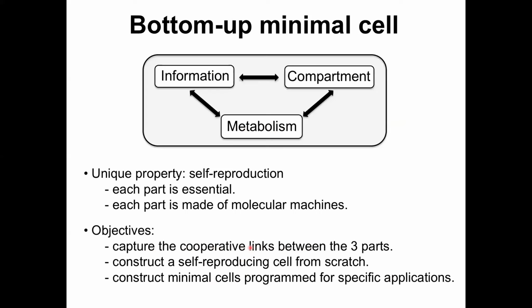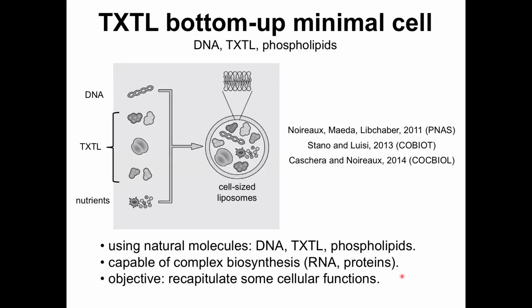Meanwhile, and everybody agrees on that, you can construct minimal cells that are very specific to a biological function to develop specific applications. And there is a growing interest in trying to integrate one or two specific functions for applications. So here is a TXTL bottom-up minimal cell.